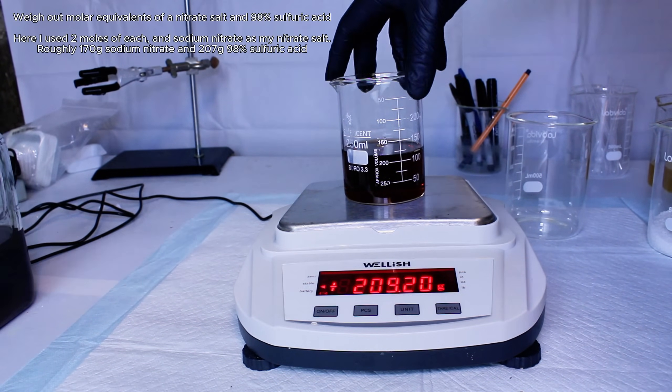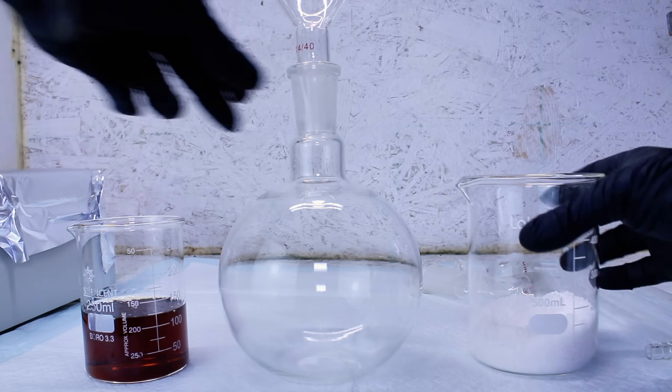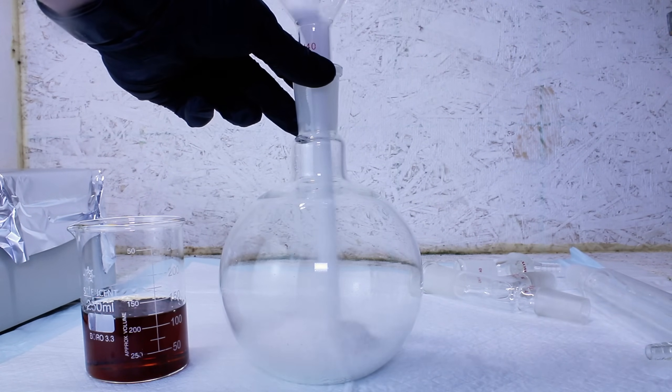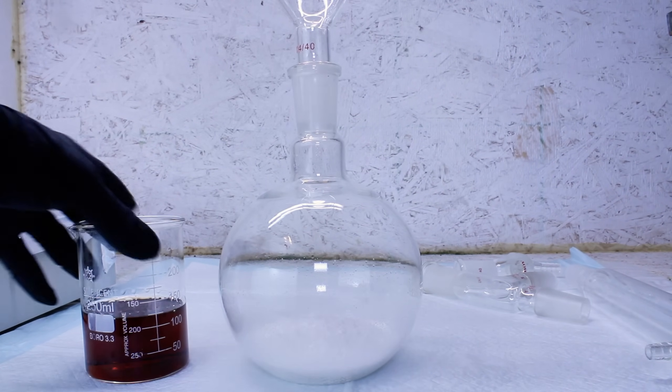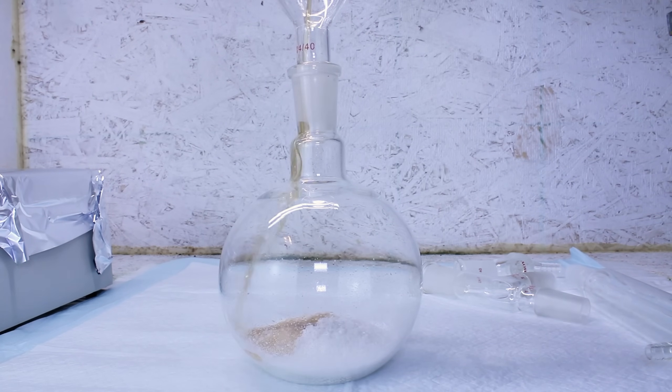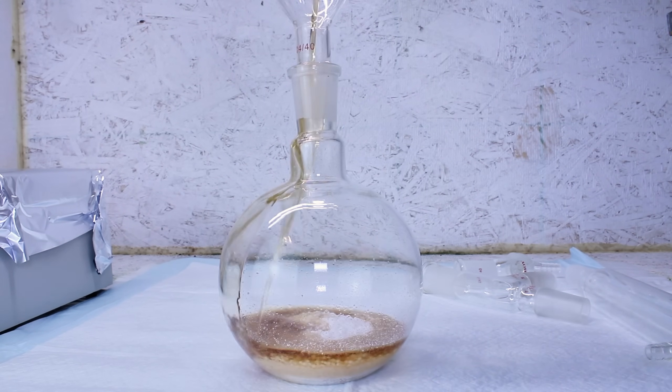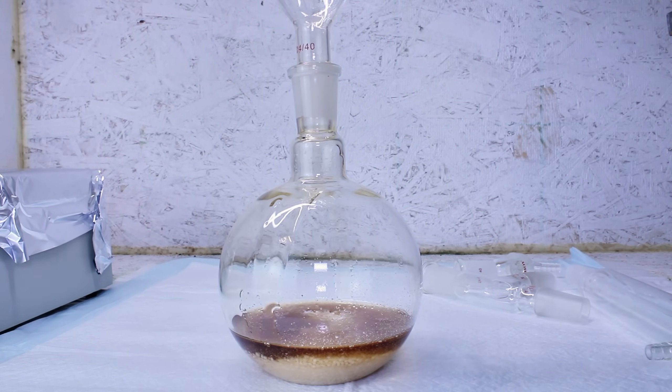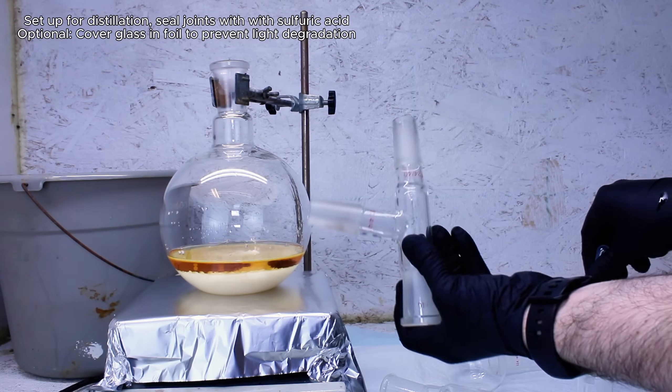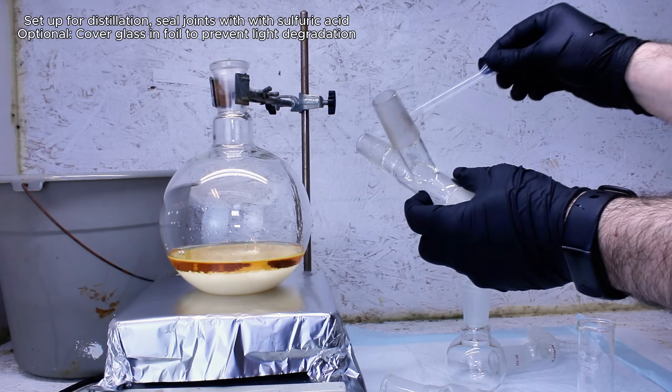As you can see here, my sulfuric acid is highly discolored, and this is because I really only use impure waste sulfuric acid from other projects to make nitric acid. These two chemicals are then added to a boiling flask and set up for a basic distillation while making sure to seal every joint of my distillation apparatus with sulfuric acid.